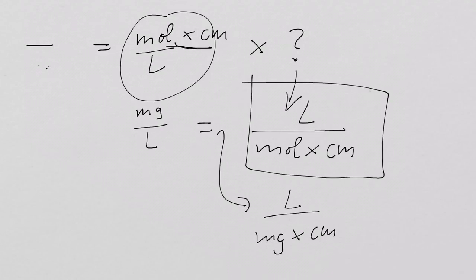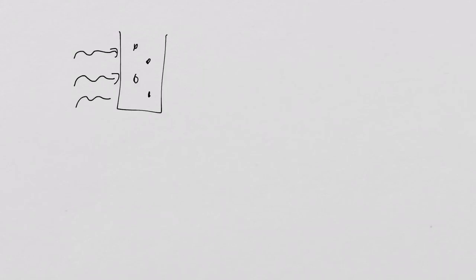Now, what I can do now is actually, and what you have done in the practical 2 weeks ago, was you measured the concentration of something by measuring the absorbance. How could you do that? Very simple. You put your substance with a given concentration into the spectrophotometer, use the correct wavelength, and measured how much comes out.